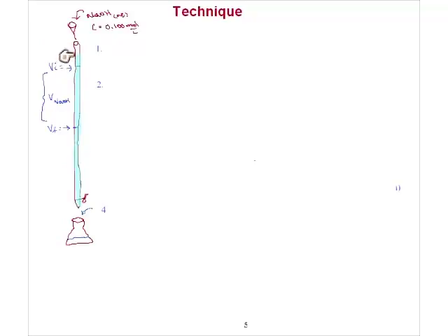And we generally overfill it a little bit, and usually what happens is there's bubbles that remain here, and you're going to have to turn the drain valve here to try and get the bubbles out, and that's why you would put a little extra in here.